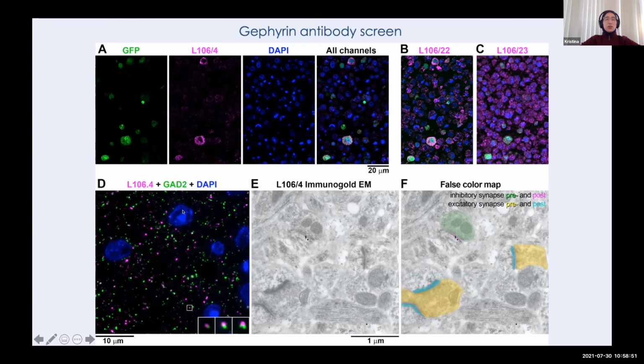Here it is used together with an antibody to GAD, and GAD will label the presynaptic bouton, and Gephyrin would label the postsynaptic part. If you focus on this specific combination of the two antibodies, it tells us there is a synapse there, because the presynaptic label and the postsynaptic label are apposed, and it's consistent from section to section. This is this same part followed on 3 consecutive sections to convince us that the staining is real.